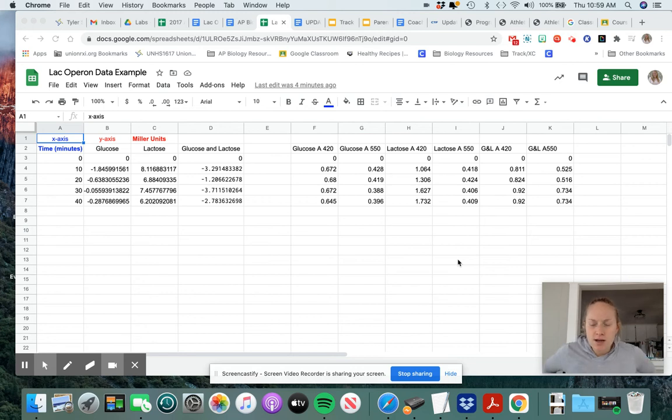Hello, everyone. I'm here to help you analyze your results from your Operon lab. So go ahead and make sure before you continue that you have your lab guidelines with you. You should have the qualitative procedure and quantitative procedure, but we're following the quantitative procedure just as a review. That's what we did in the lab. We did the quantitative procedure.